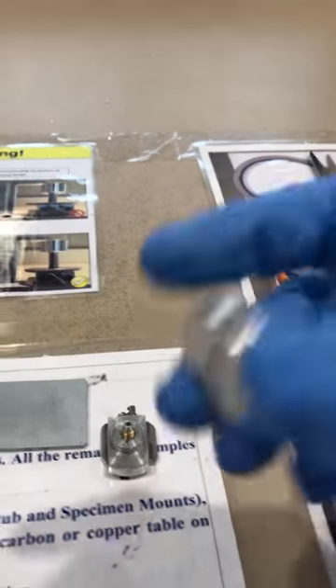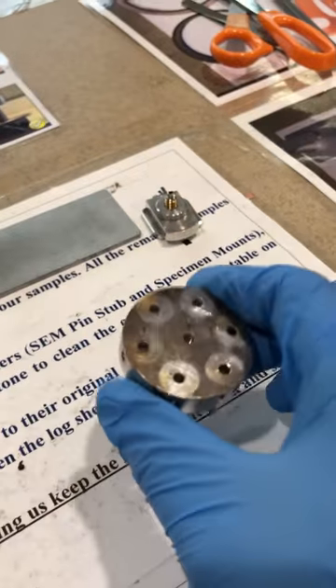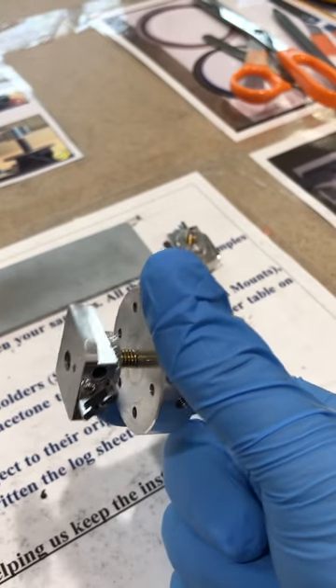We have screws and knobs that you can use to make a stand for your sample holders. You can simply screw this into your stand based on the sample holder you choose. On this training session I'm using a multiple sample holder, mounted with the screws and knobs and fixed to the sample holder.